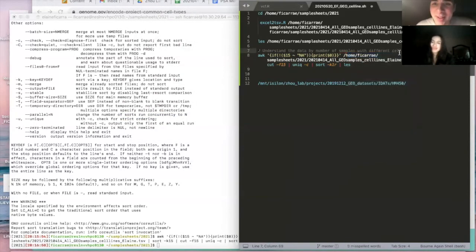I've always been bad at spelling. It's been actually very bad for a long period of time. So now what we want to do is perform VAF on one singular cell line sample. Let's just do one sample.